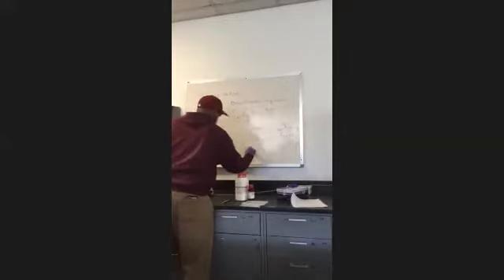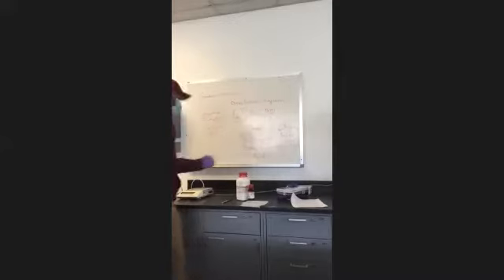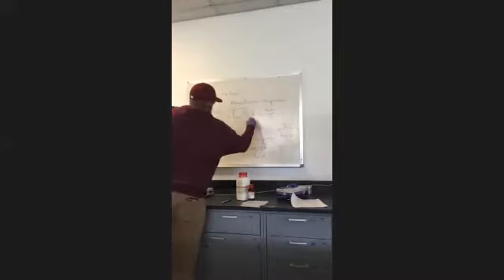And this is acetyl salicylic acid. Right, that's what we're making, acetyl salicylic acid. That's the proper name for aspirin. All right, and so the way we're going to do this is we're going to take salicylic acid, we're going to take acetic anhydride. I can write the name of that down.